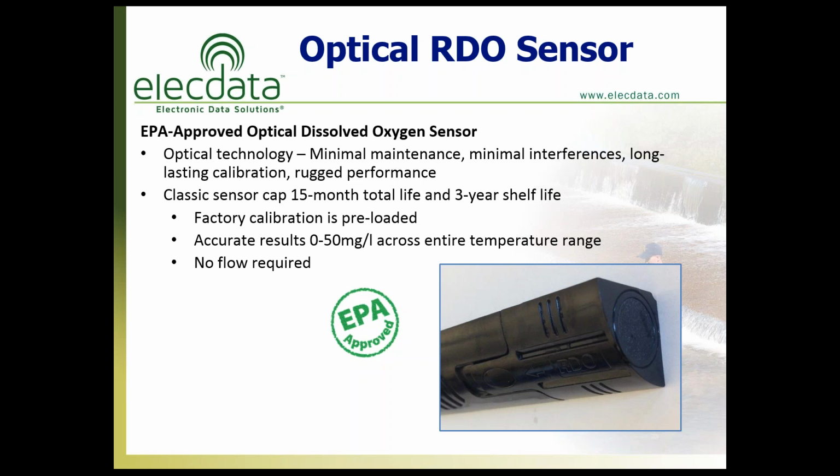So if you didn't have movement of water across that sensor, either from natural means or via a stirrer, which was quite common, and there were even some companies that tried to rapidly pulse that DO sensor so it had time to replenish that water. Not an issue with optical dissolved oxygen sensors because there is no consumption of DO during the measurement. Now the removable sensor caps on this, In-Situ has those last for 15 months after they're installed.